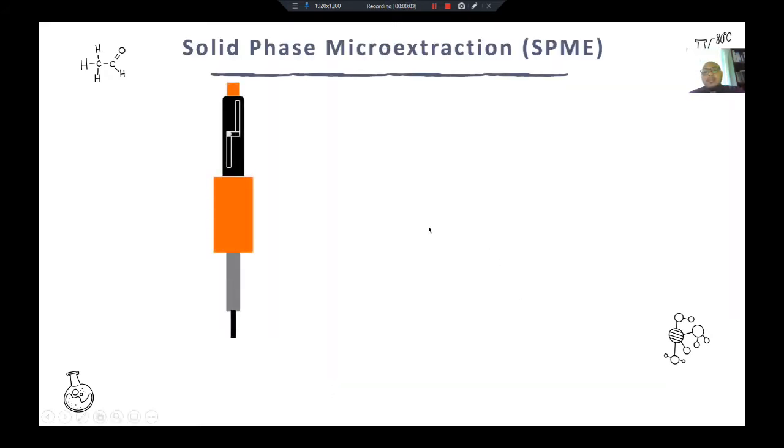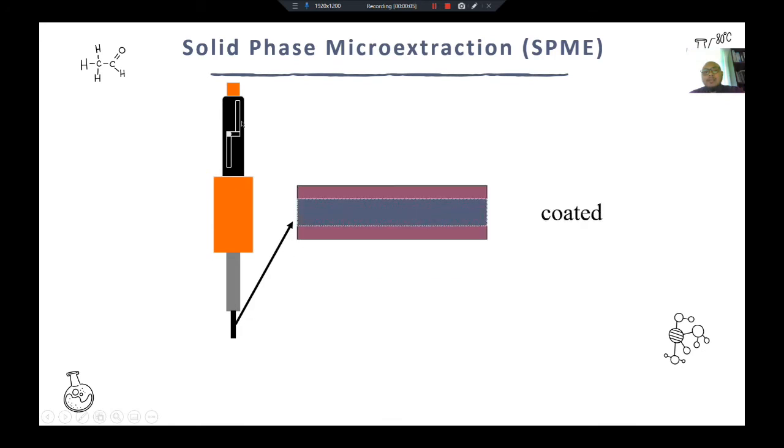Here is another figure. Right now here is the device. Inside the device we put the fiber. This fiber we can change, we can change to polar or non polar, depending. So inside here the fiber is actually vertical, it's drawn horizontal, but it's supposed to be vertical.